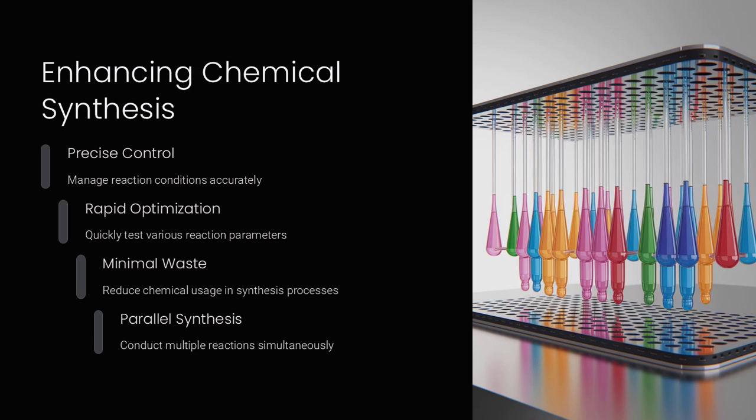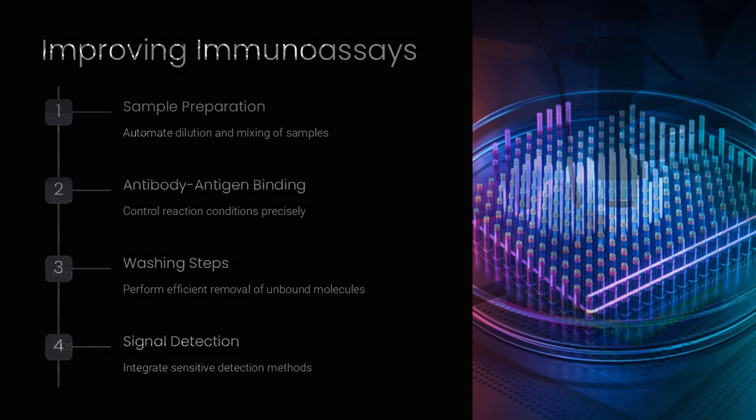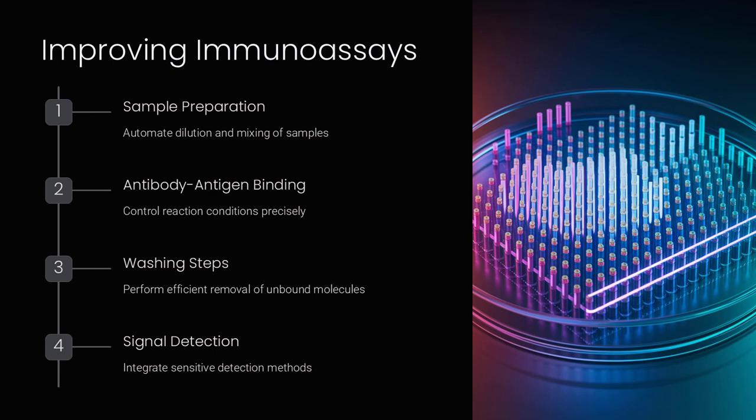Despite its many advantages, digital microfluidics faces several challenges, including issues with droplet evaporation and electrode fouling. Maintaining precise control over droplet movement under varying environmental conditions can be complex, and the integration of multiple functions on a single chip sometimes leads to design trade-offs between complexity and reliability. Ensuring consistent performance and scalability for commercial applications remains an ongoing research focus, with efforts to address these limitations through improved coatings and electrode designs.